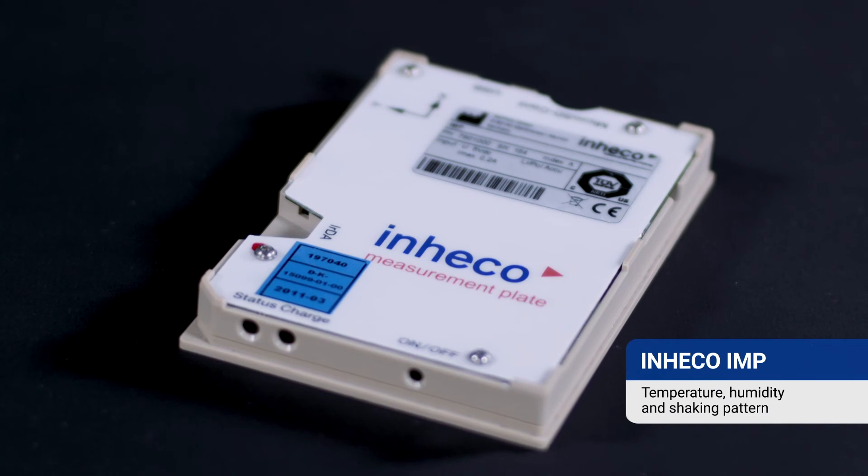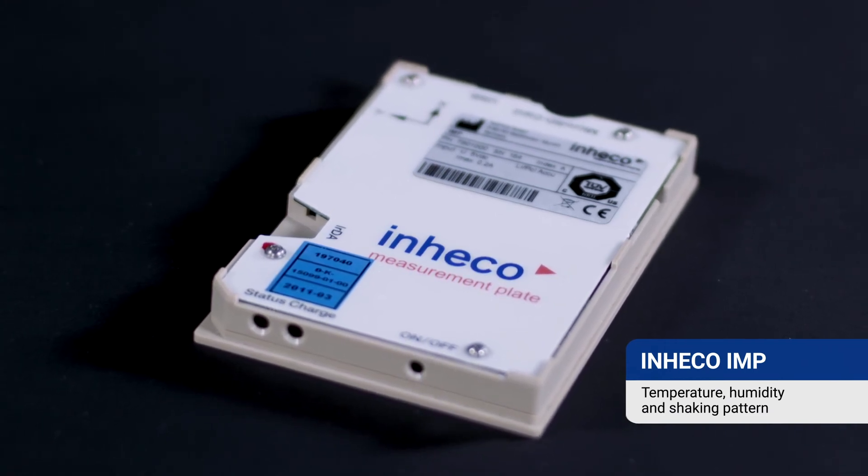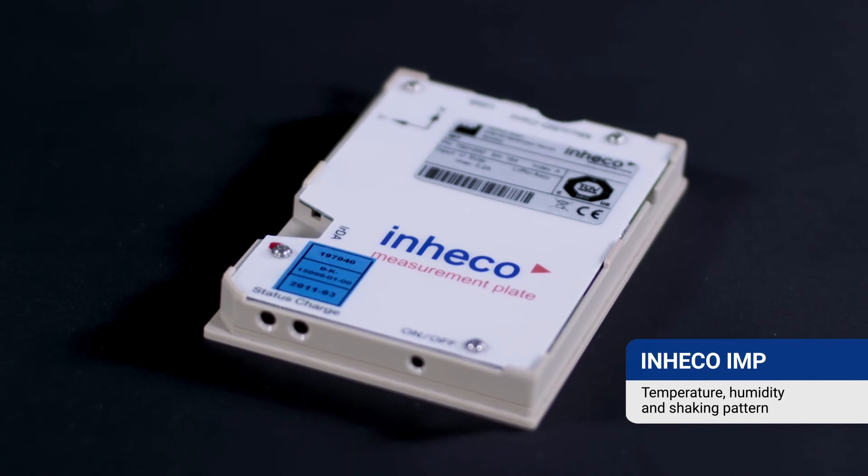Our Inheko measurement plate IMP enables wireless verification of temperature, humidity and shaking pattern.